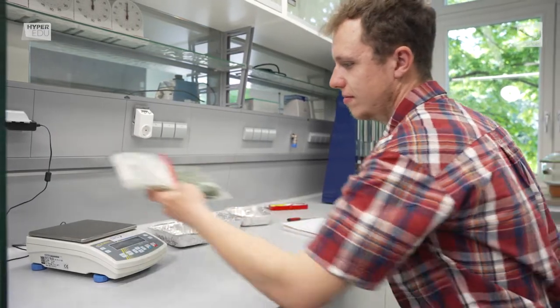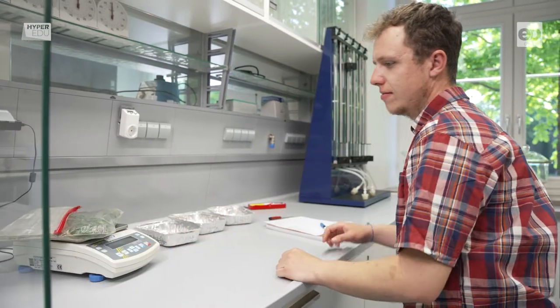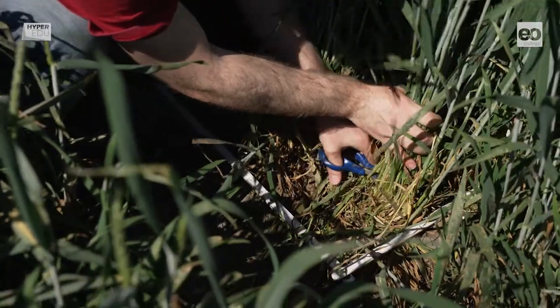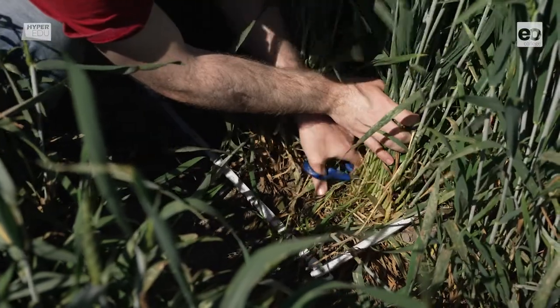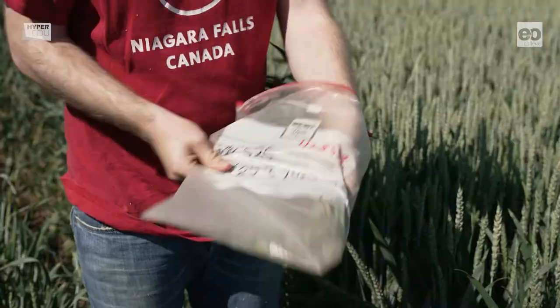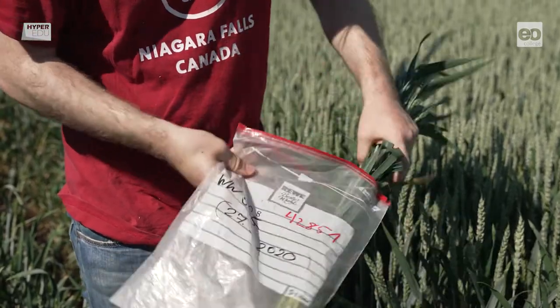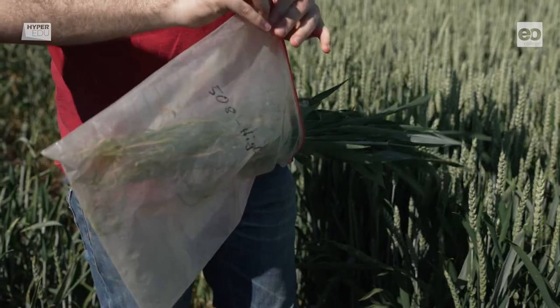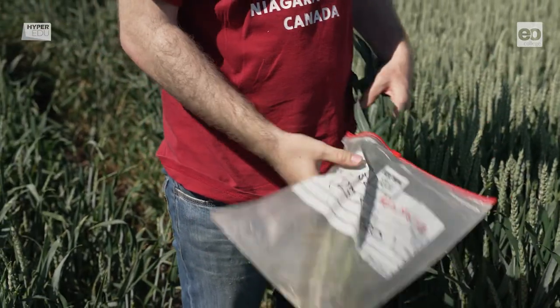Meanwhile, Benedict weighs all plant biomass samples — including the plastic bag. The plastic bag preserves the inner moisture of the sample so that evaporative losses which may occur during transport from the field to the lab do not bias the measurement. The plastic bag contains the entire above-ground biomass of a 50 by 50 cm wheat field area.